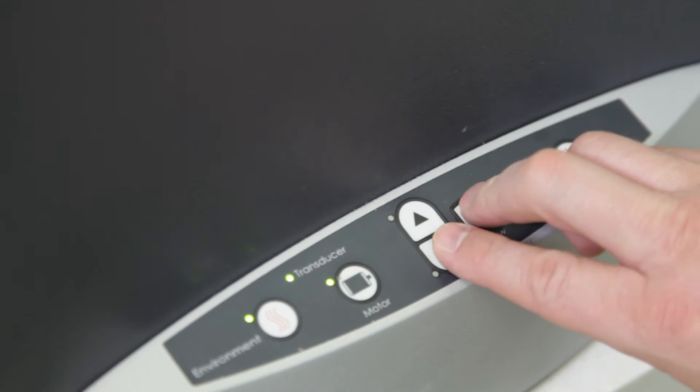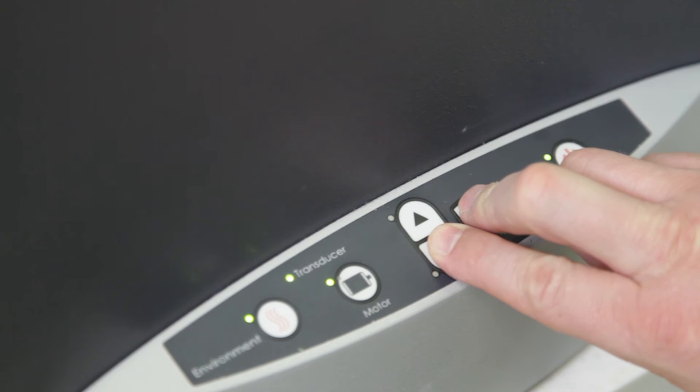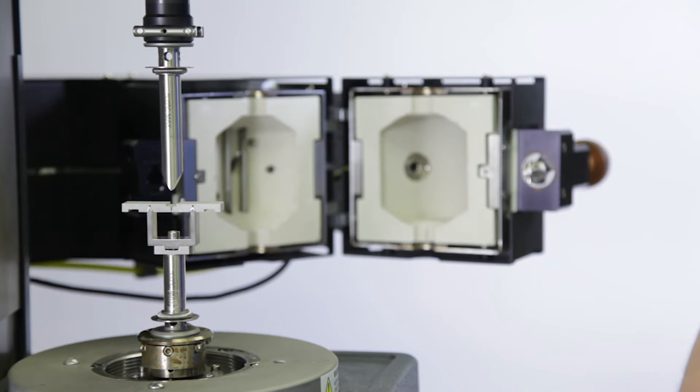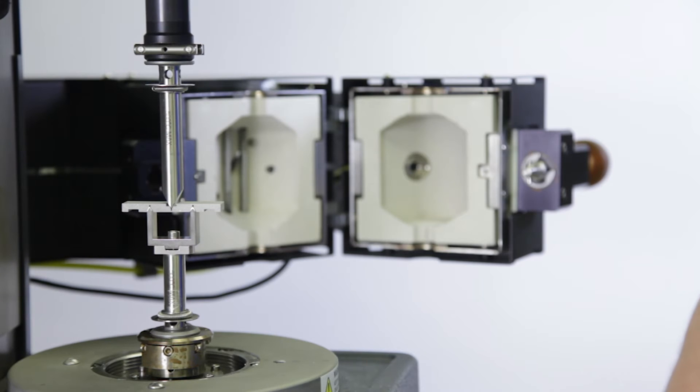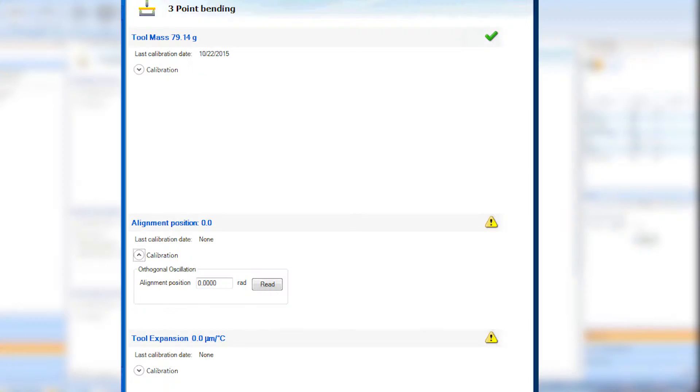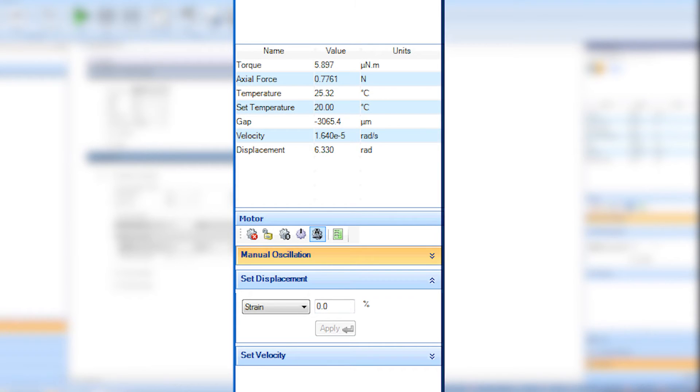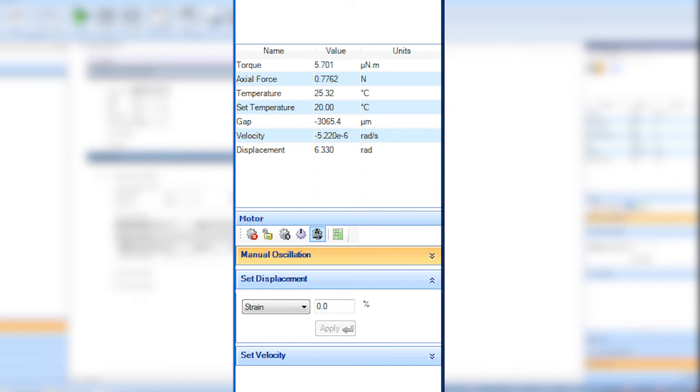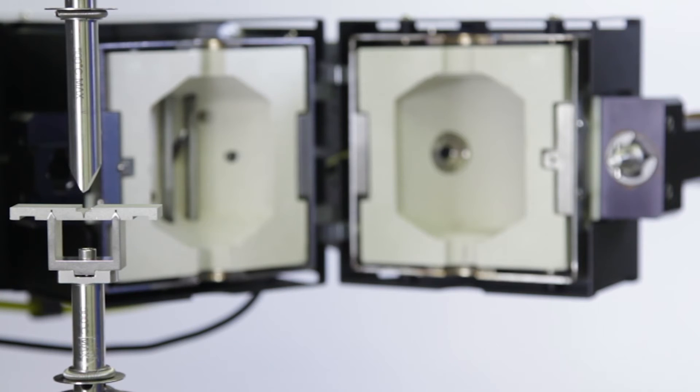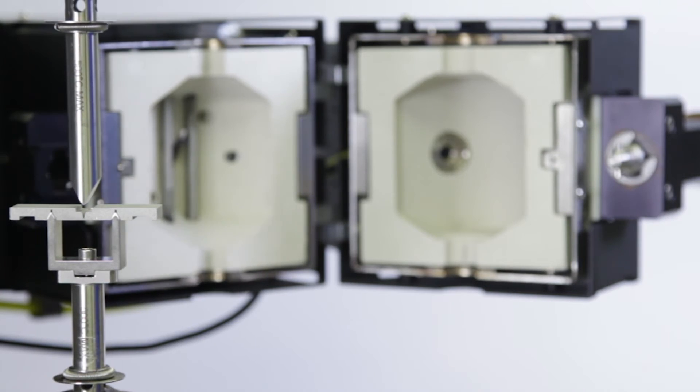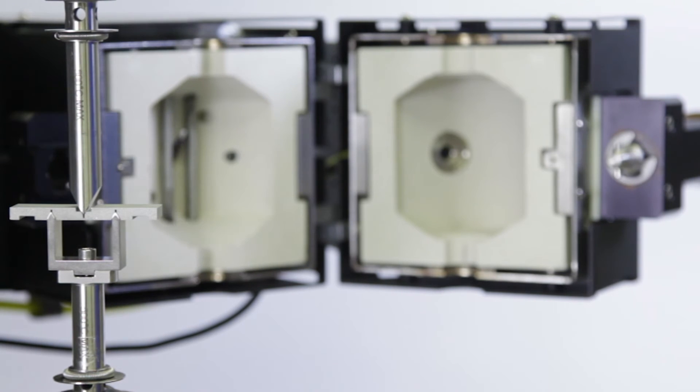Manually rotate the motor to align the upper fixture with the alignment tool. Using the up and down buttons on the keypad, carefully lower the upper geometry until the geometry is fully inserted into the V slot of the alignment tool. Apply an axial force of about one Newton to ensure alignment. Then, from the geometry calibration window in TRIOS, read the alignment position. You can now use the move to alignment position and motor lock buttons in the motor control panel at any time to return the geometry to the alignment position and lock it in place. This guarantees the geometries are always aligned with one another during testing.